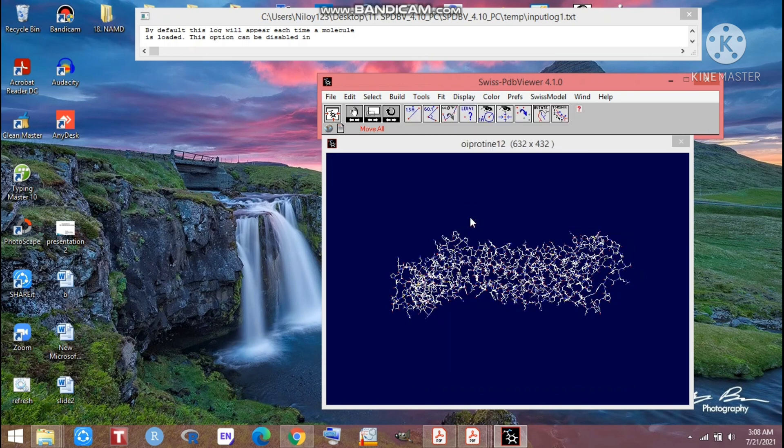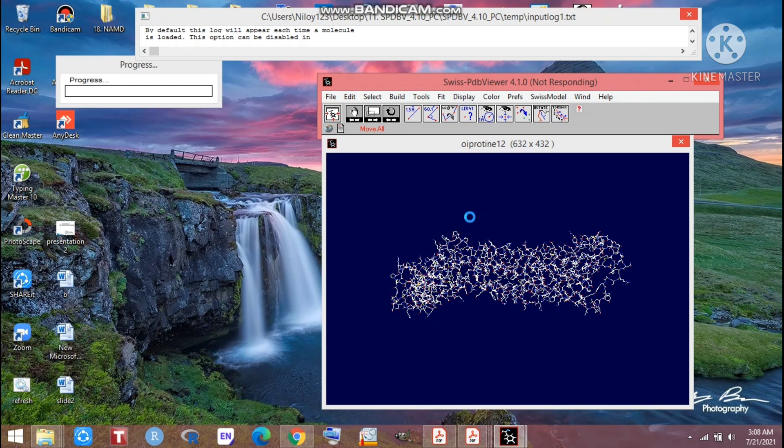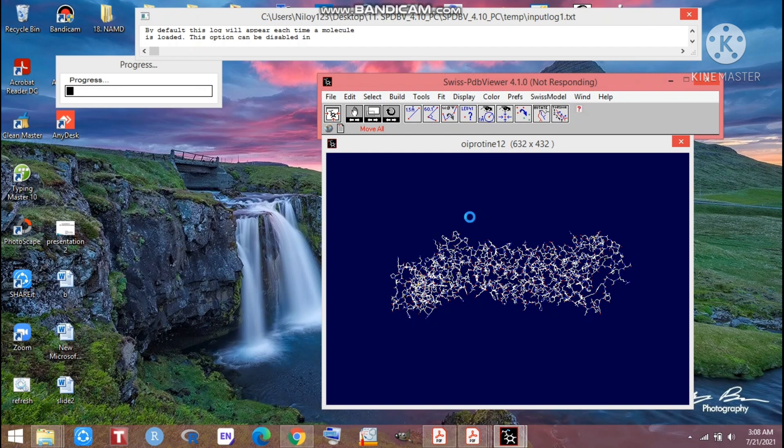After clicking on energy minimization we will get another window here. Just wait for this window. Look at that, the progression is running and after progressing we will get a window about the energy minimization.